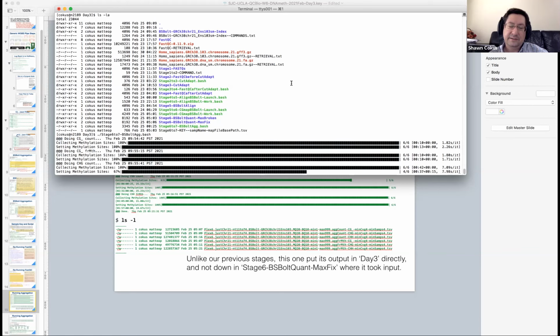All right. So you guys, it's run successfully for you guys? Somebody?